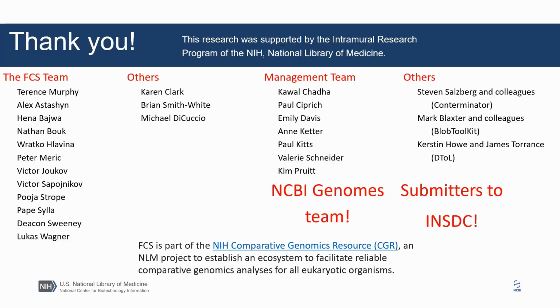We have a lot of people to thank for work on this project. And the last thing I would like to mention is that FCS is part of the NIH Comparative Genomics Resource, an NLM project to establish an ecosystem to facilitate reliable comparative genomics analyses for all eukaryotic organisms. And I'm happy to take any questions.